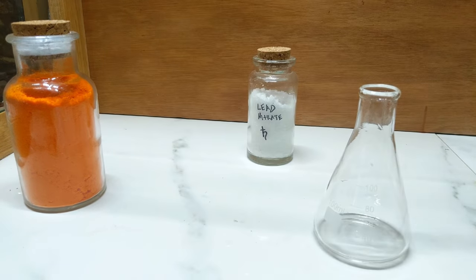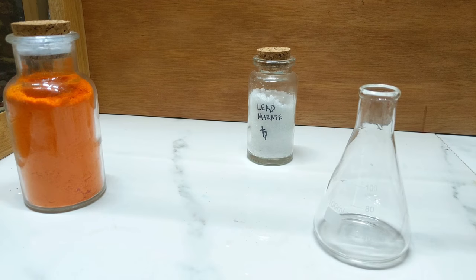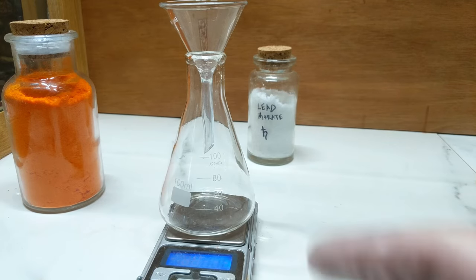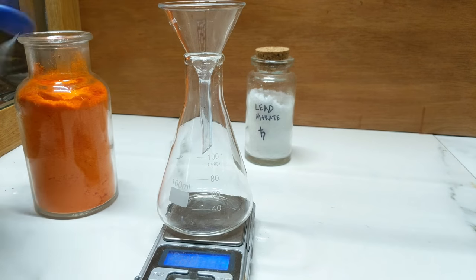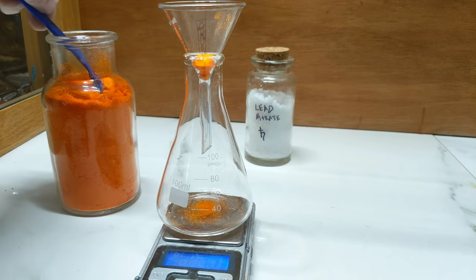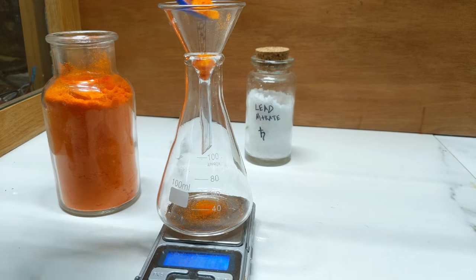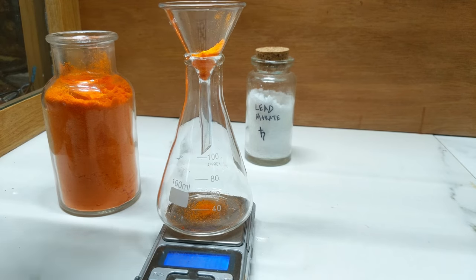Place that to the side, and into here we will be putting 2.25 grams of potassium dichromate.